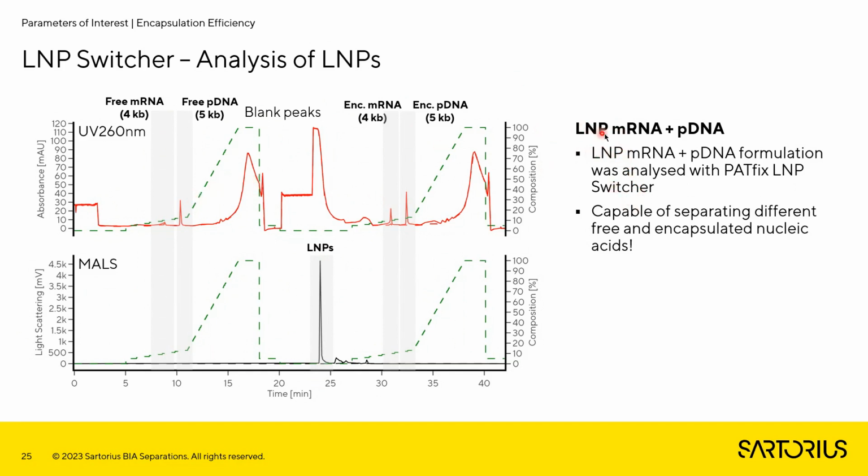In this case, we analyze co-encapsulated mRNA and pDNA in a lipid nanoparticle, and we can see that in the area of free nucleic acids, two peaks are detected representing free mRNA and free pDNA, and also in the area of encapsulated nucleic acid elution, we can see both peaks representing mRNA and pDNA.